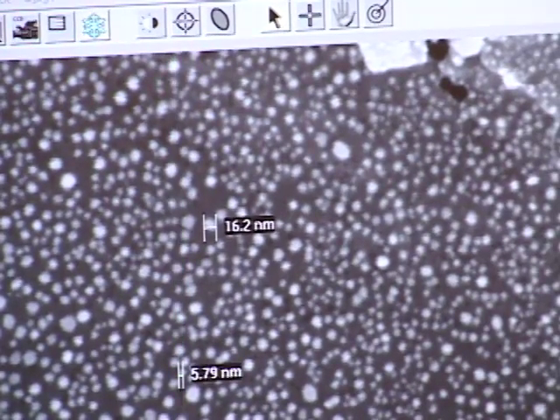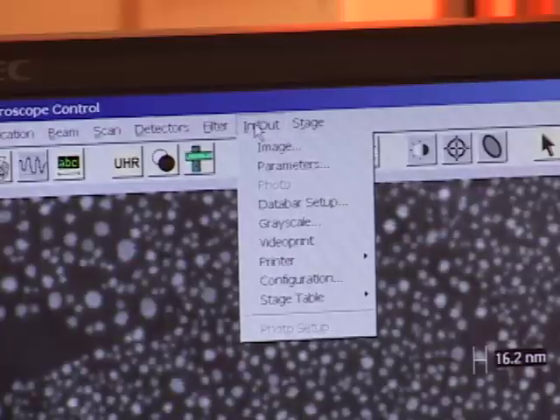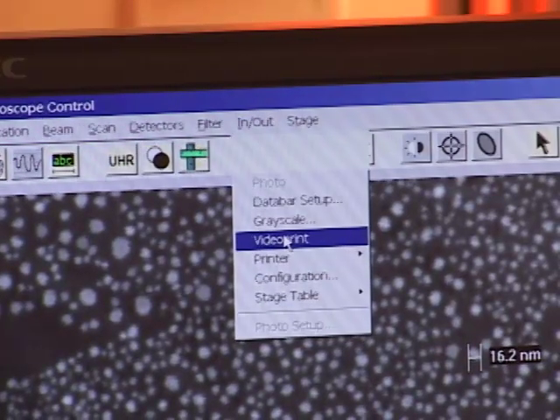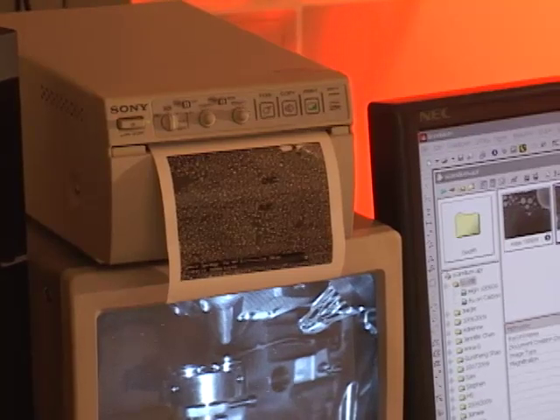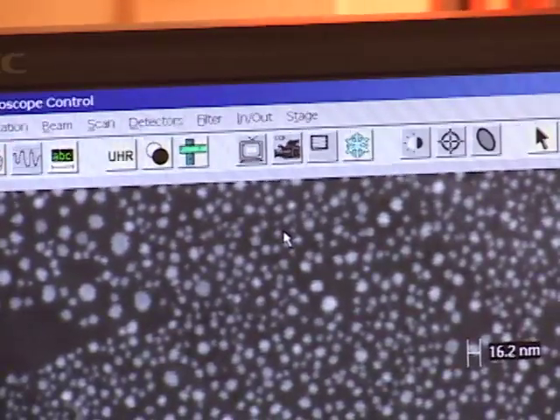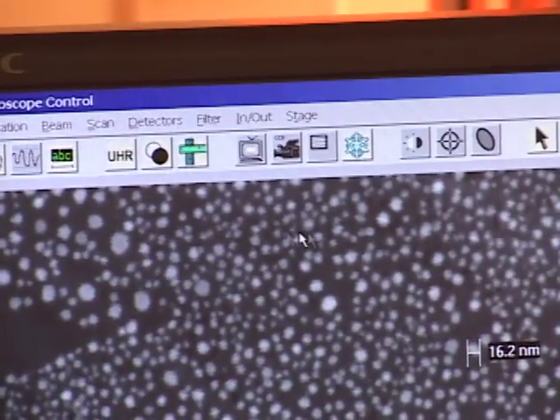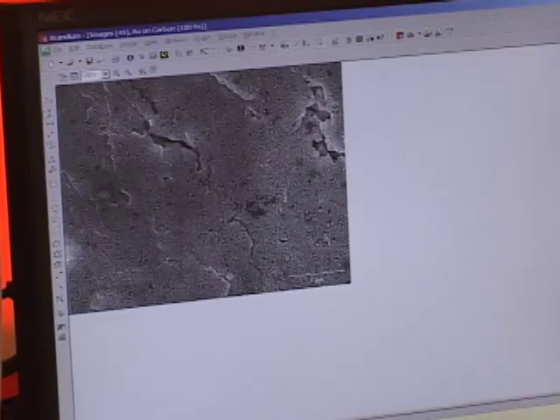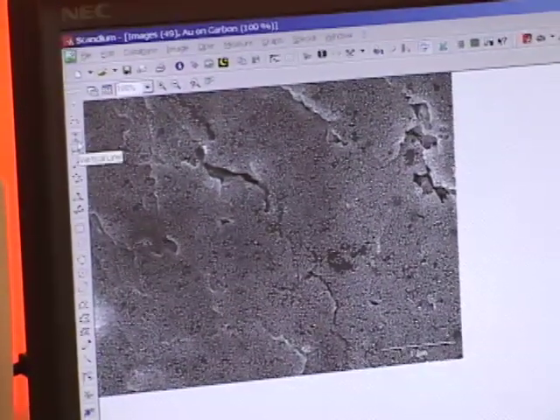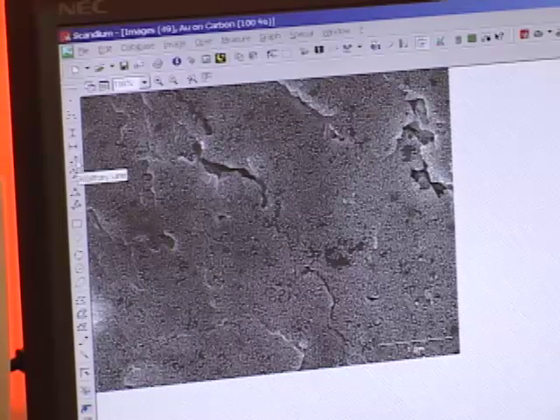After I've labeled the picture, I can print this image with the labels on it by going to in-out, video print — we have a thermal printer that will produce that right here. If you wanted to save an image with these labels on it, instead of using this measurement tool, you'd use the Scandium measurement tool. Down along the left margin you see there are different axes — vertical measurement, horizontal measurement, or arbitrary line.